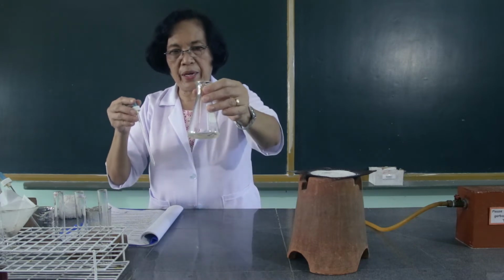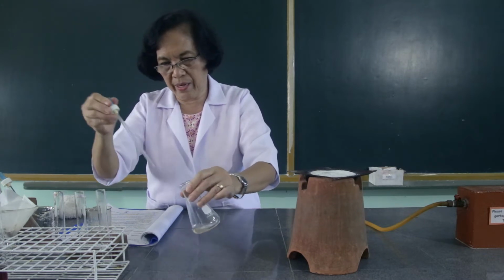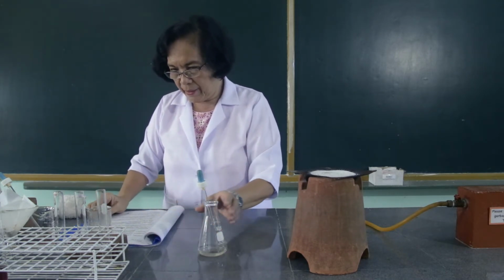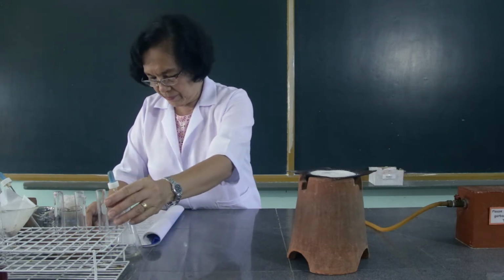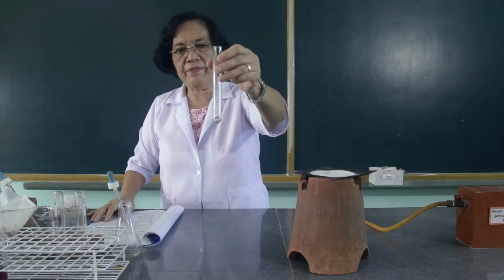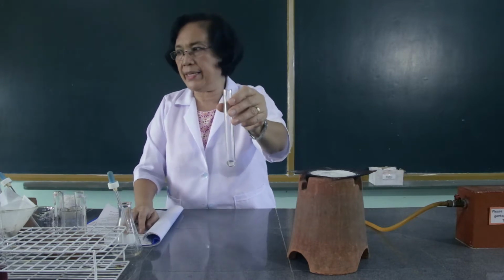So we will use 1 ml of the filtrate to be tested for chlorides. We will acidify this with nitric acid. So when we say acidify, we're going to add the acid until the point that the blue litmus paper will just turn red.